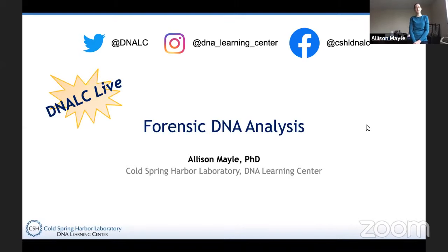So today on DNALC Live, I'm excited to talk to you about forensic DNA analysis. The technique I'm going to talk about is not actually used very much in forensics anymore, but it's a way to introduce some important molecular biology and molecular genetics concepts and techniques, and it's kind of fun to still do them in the context of forensic science. So I'm going to start by introducing you to restriction enzymes and gel electrophoresis, and then we will use those tools to try to solve a made-up crime.